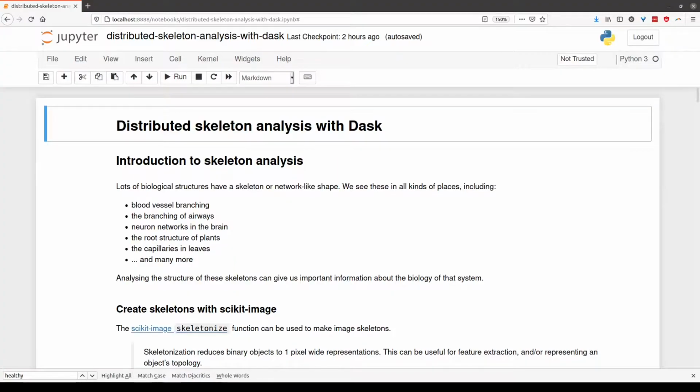What we were finding is that even for fairly small data sets like these, some of the steps in the pipeline were really memory intensive and it was causing crashes. So we're able to use Dask to keep below our memory ceiling. I've made an example notebook here that I'll share with you all, turning this analysis that would work for small scale data into something that we could do in a distributed context.